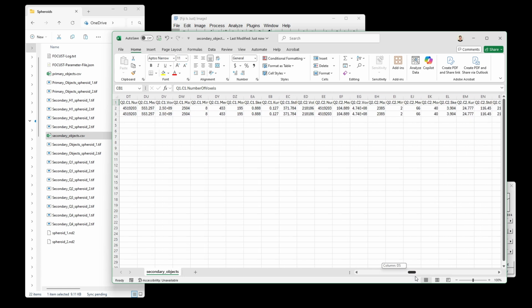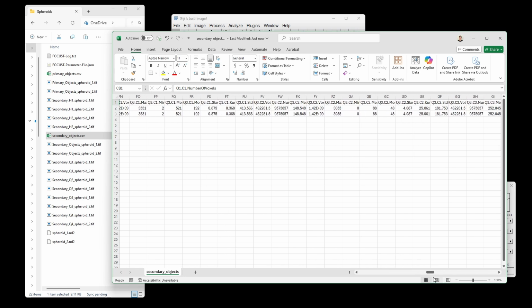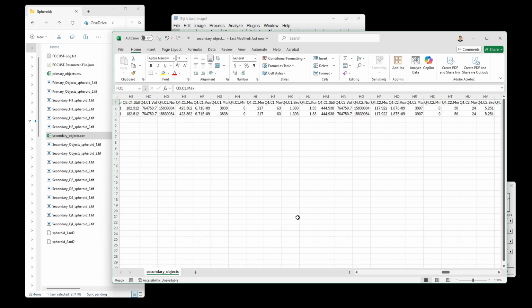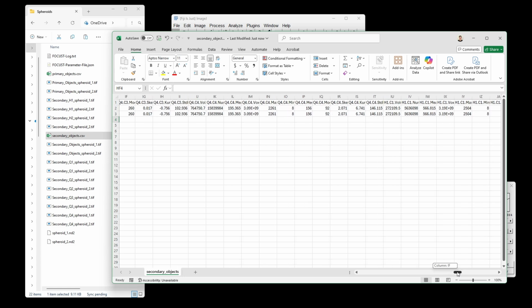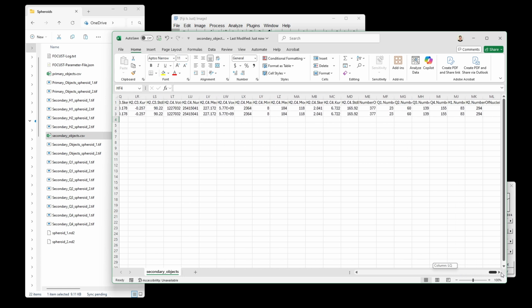And as we get towards the end of our data set here, we have all of this intensity data. So what's really great here is we can get a breakdown of expression of proteins of interest as a function of spatial distribution throughout the spheroid, right? So we now know the intensity, or the mean value, if you will, of channel 1 in the outermost band, because it's Q4. So these bands really give us the ability to stratify the shape and therefore query where inside the shape something was most or least intense. We also get the same for the halves as well.